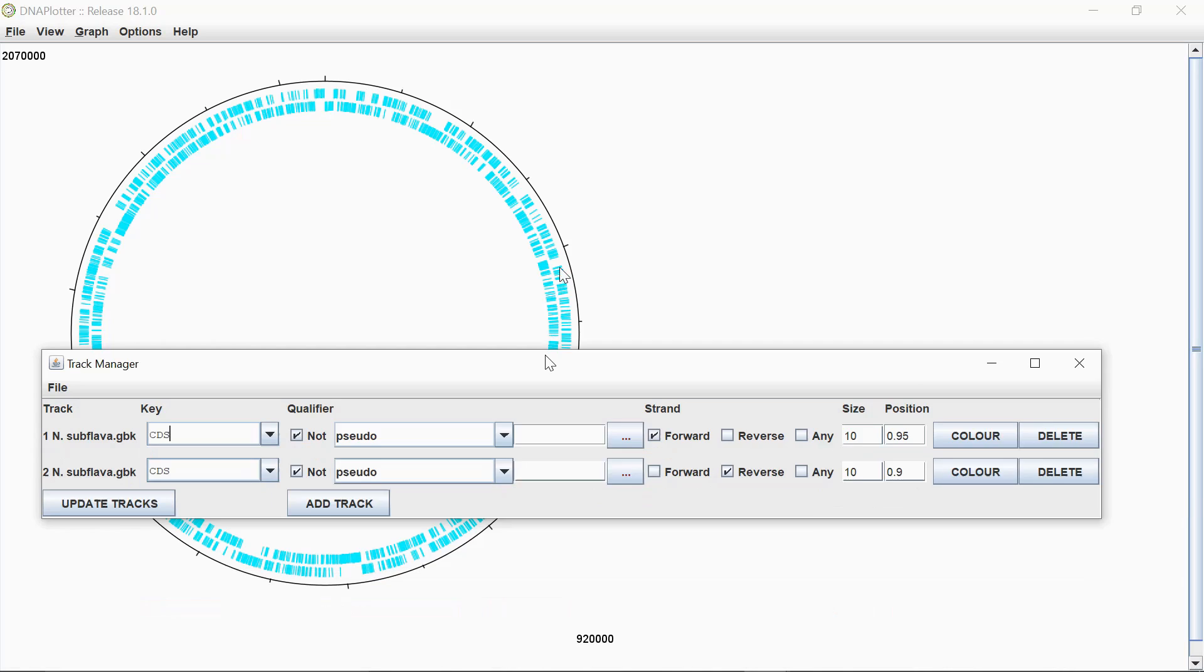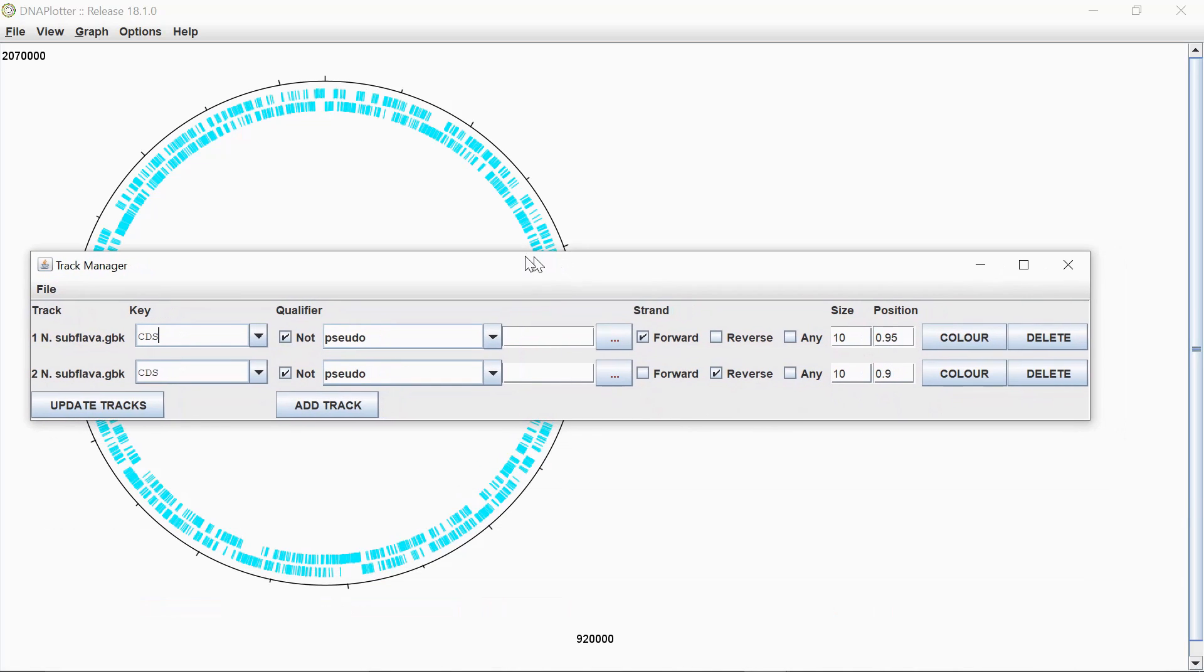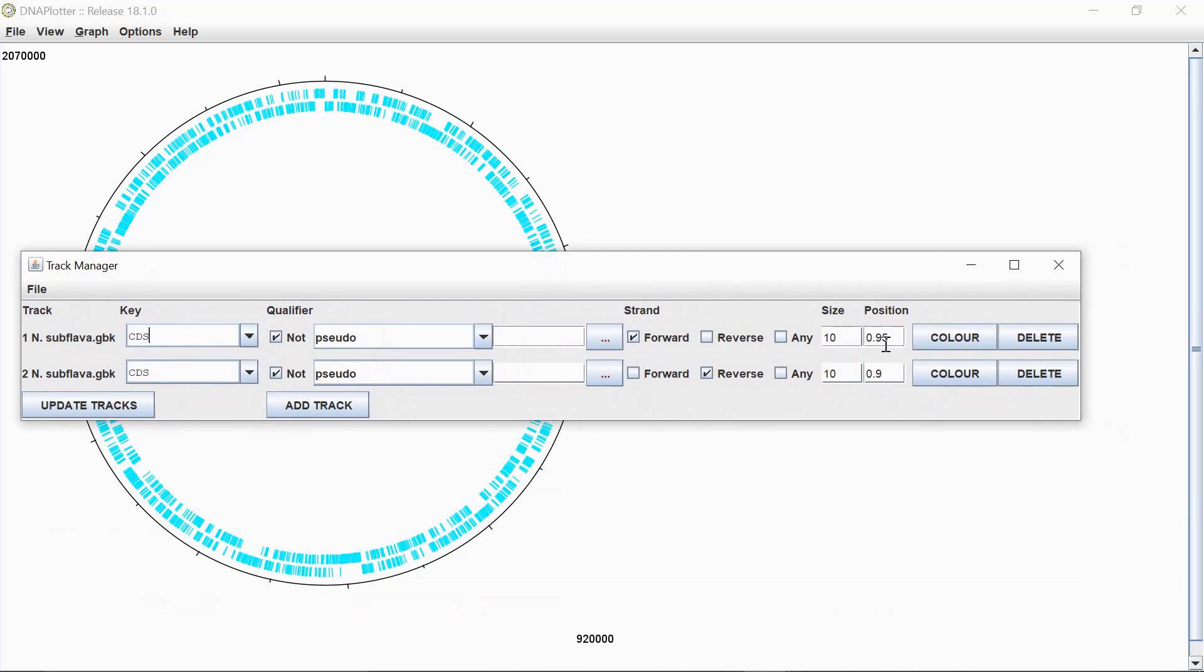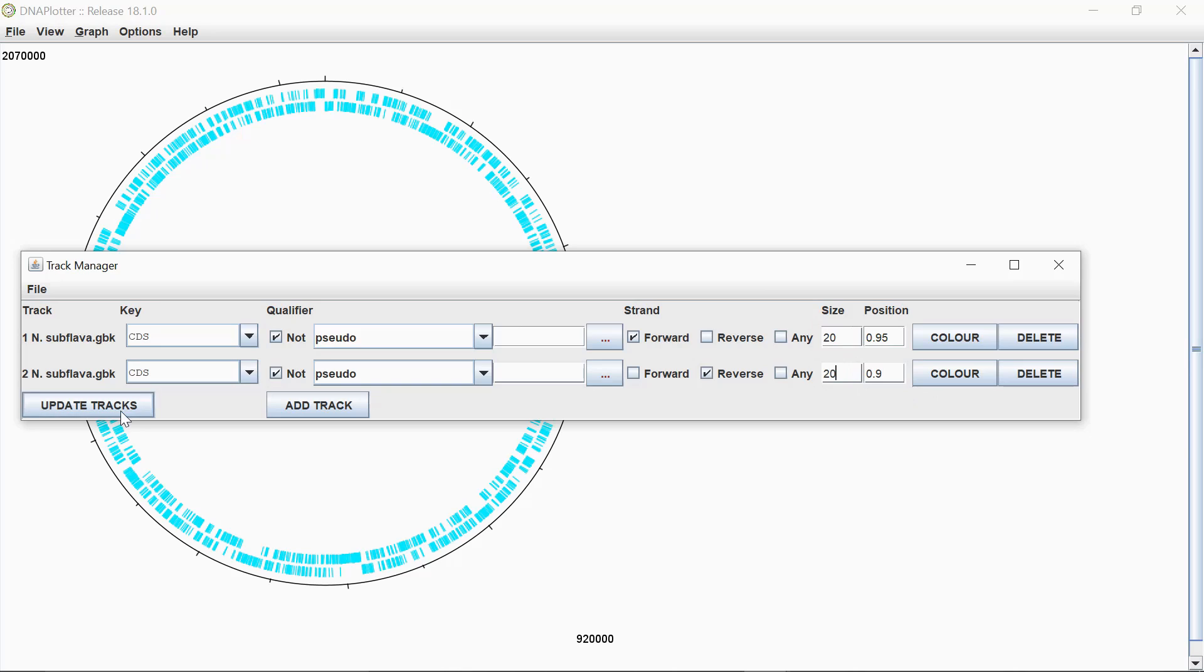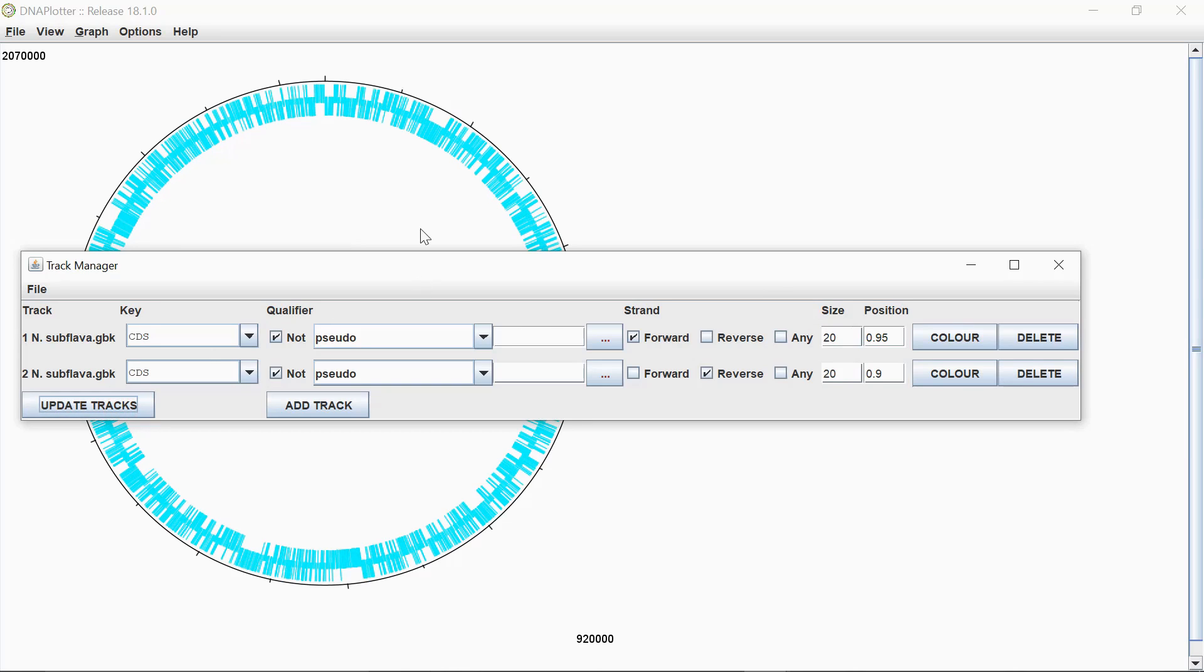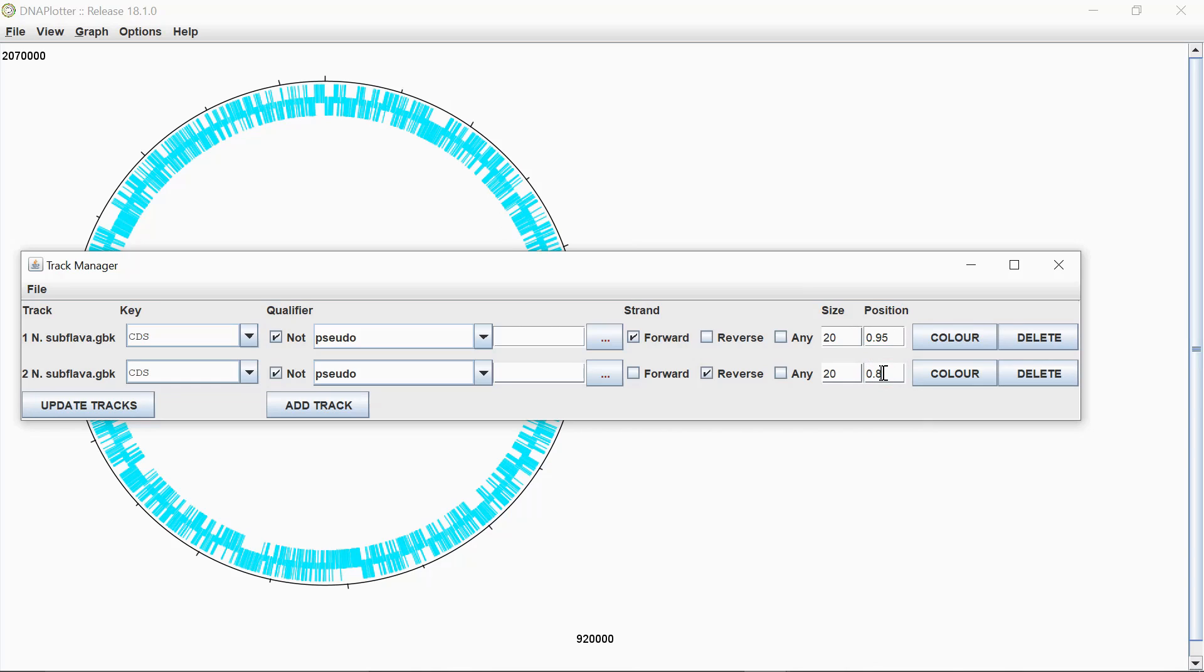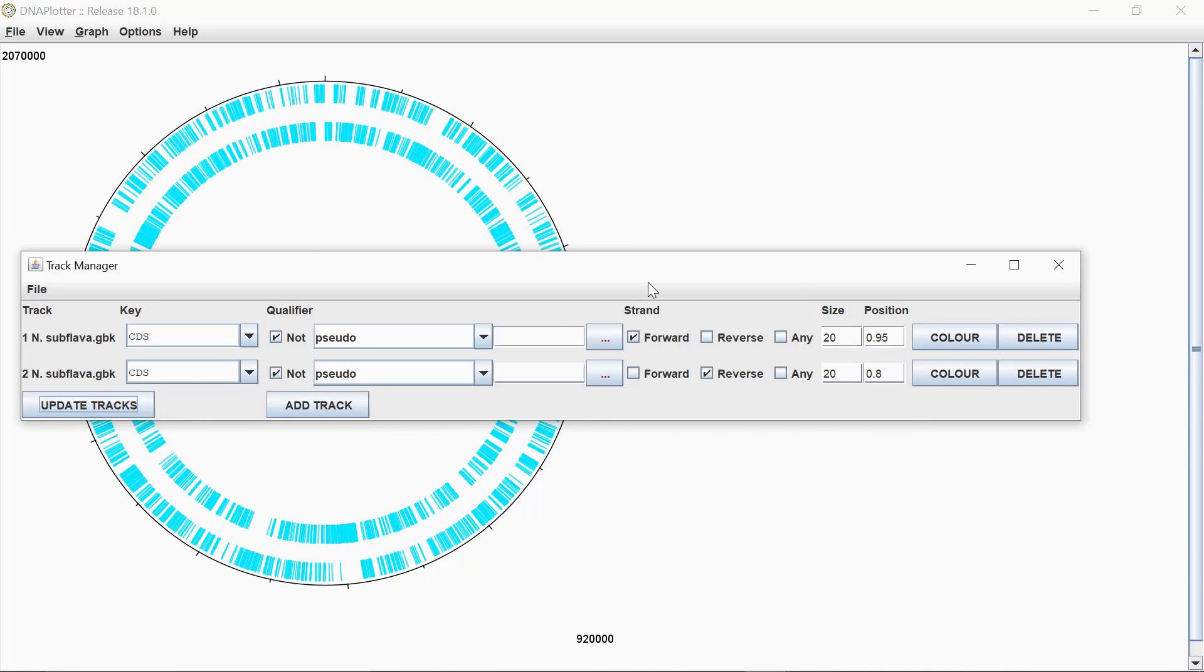What you can also do at this point is adjust the position and the size of these lines. So for example, I adjust this to 20 here and 20 here. Press the update tracks. You can see it makes these a little bit larger. Additionally, you can change the position of these if you want to move them. If you change that, say for example, to 0.8 and then update tracks again. You see now it starts to look a bit like that.